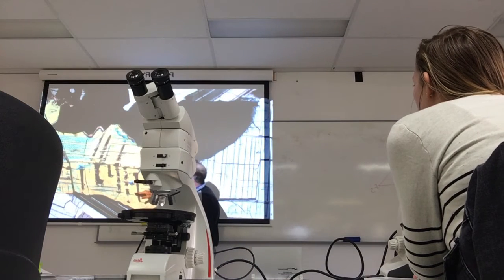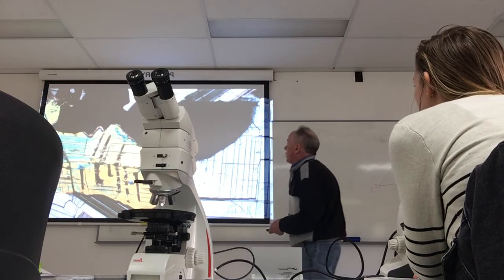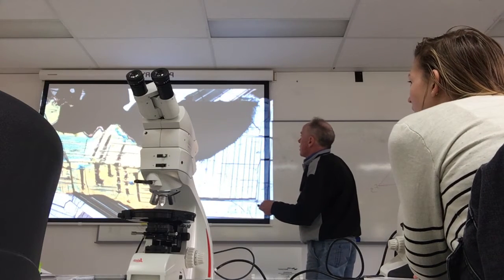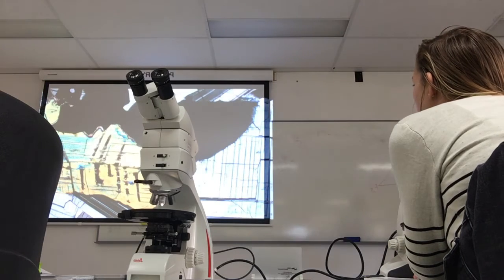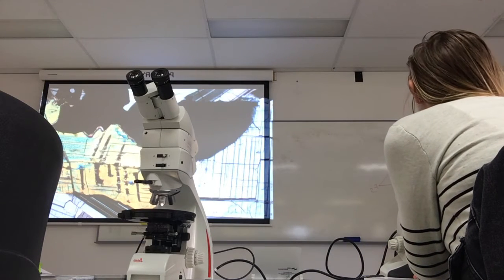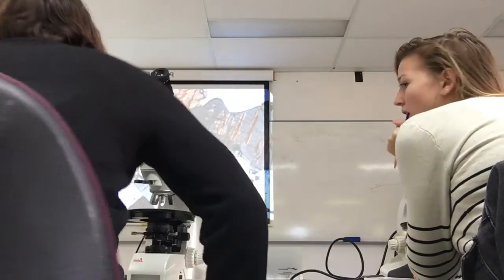And it's overprinting this one here. So it's happened twice in the case of this grain. You've got two phases of exsolution. The early big one's the most obvious one. And what it shows really nicely, and I'll just try and get that back up so it fills a lot more of the screen, is they call that herringbone texture.